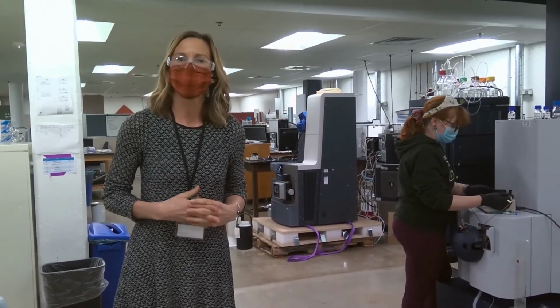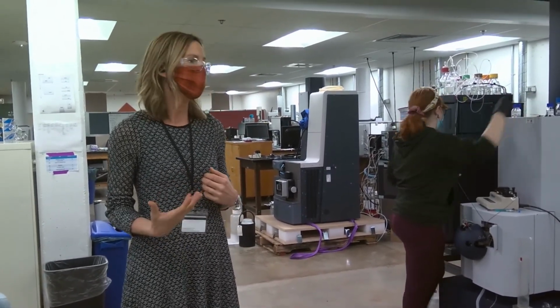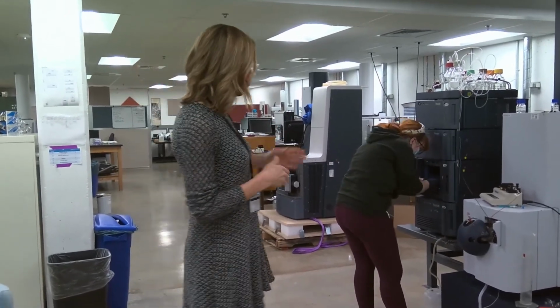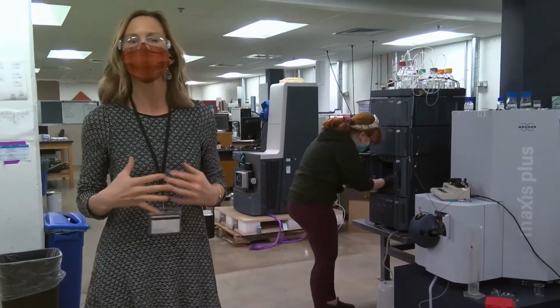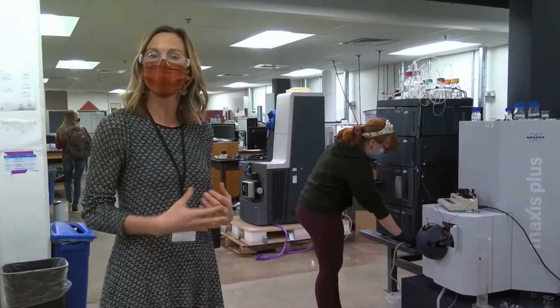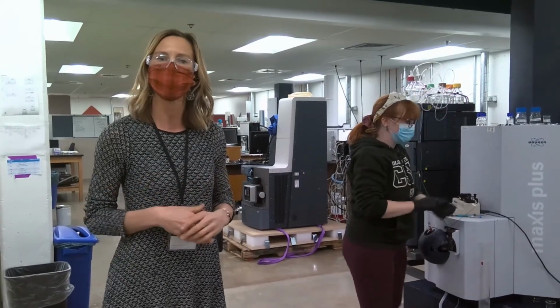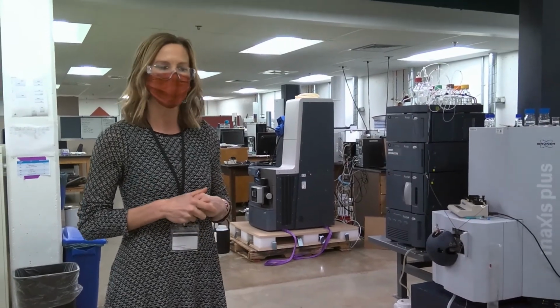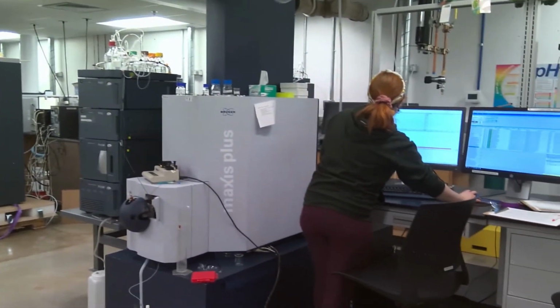Undergraduate and graduate students can actually work in the ARC, and we hire them as student hourly interns or GTAs. So you can see Elena, she's one of our undergraduate students. She learned how to maintain and fix and repair instruments. She runs samples for our customers. She even helps with training and basic sample preparations. These students sometimes start here in their freshman year, and they work for us throughout their entire undergraduate degree. And they walk out of here with a ton of hands-on experience.